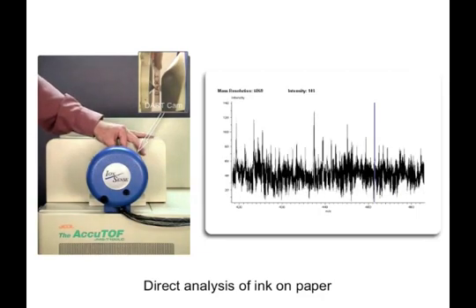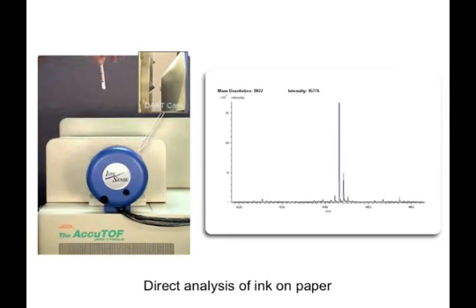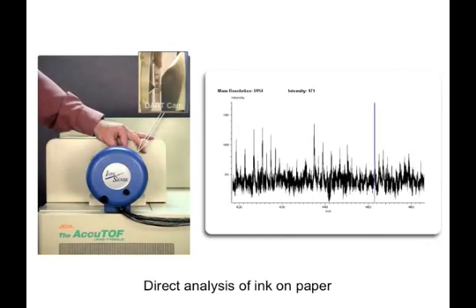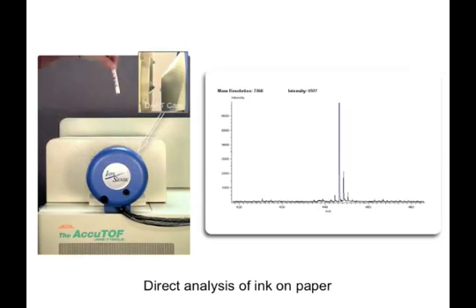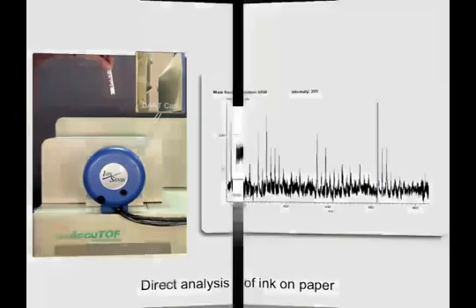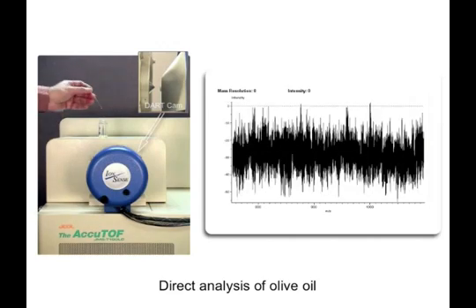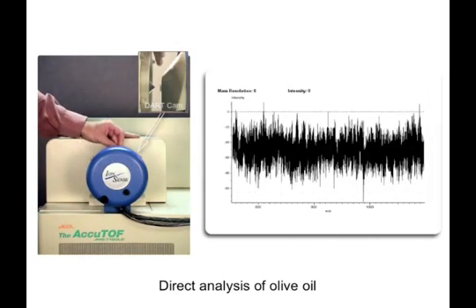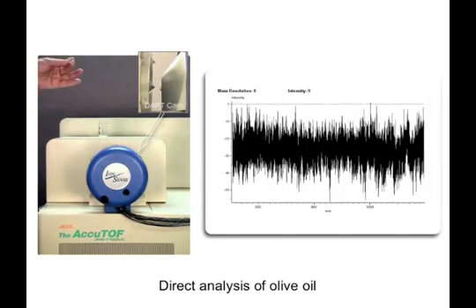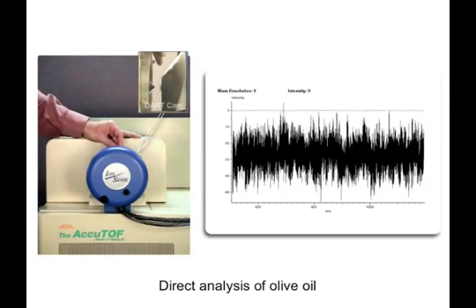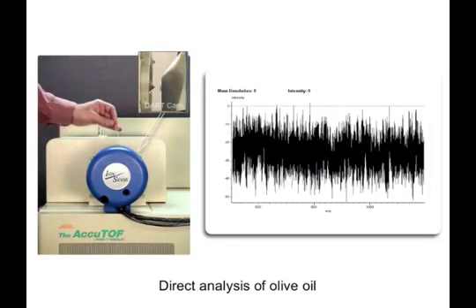In the inset, the gas is blowing from the right to the left out of the DART ion source into the mass spectrometer sampling orifice. We're repeating this to show how reproducible the signal is. Here we're just dipping a melting point tube into an olive oil sample and holding the sealed end of the melting point tube with the olive oil droplets on it in the DART gas stream. What you'll see in the mass spectrum is actually the triglycerides in the olive oil — primarily triolein, but other things as well.